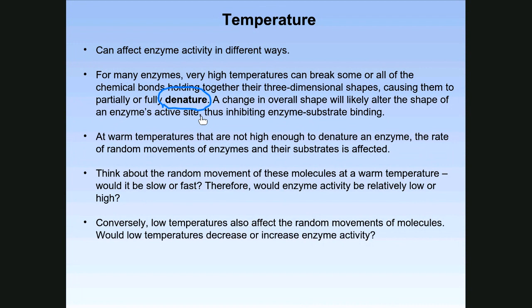So when you look at that data, you first have to see, is the enzyme producing product? And if it is, how much product is it producing? Then you have to compare the different temperatures and determine, did any of these temperatures inactivate the enzyme by denaturing it, and therefore it's not producing any product? It's inactive, it's been inhibited. Do any of these temperatures slow down the rate of enzyme activity?